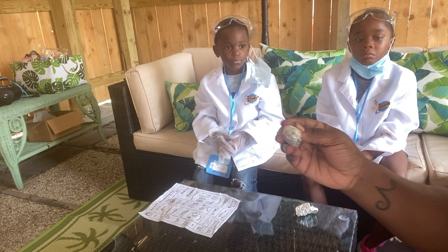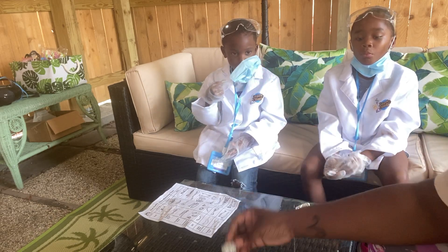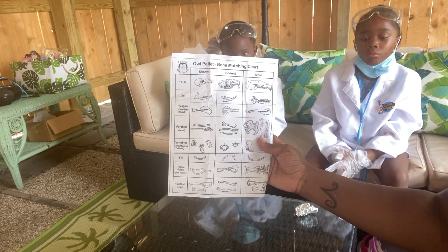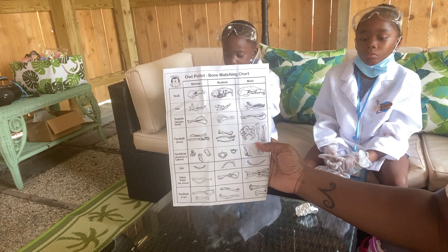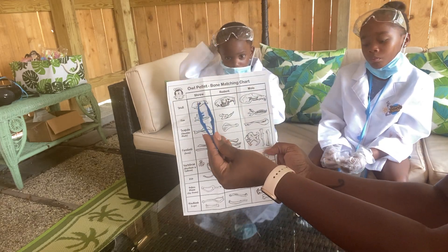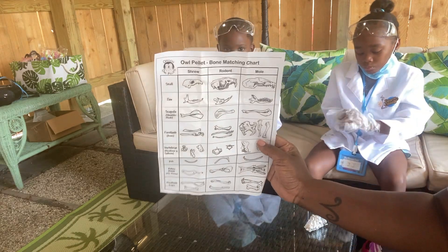So what we're going to do is dissect it so we can see exactly what type of rodent or animal it was that they ate. They usually eat shrews, rodents, or a mole. And whatever they eat, you can see based on this chart what it is.